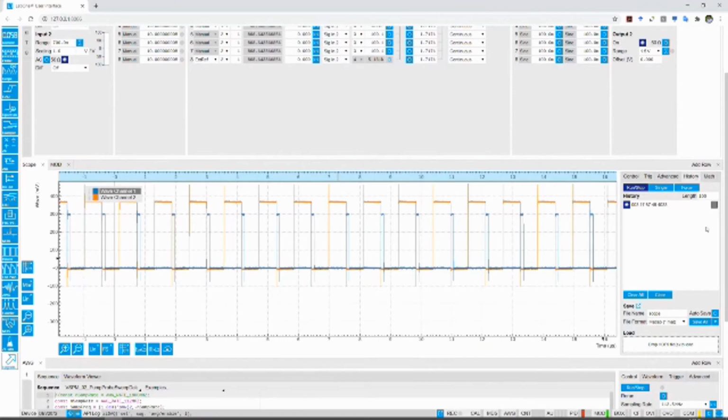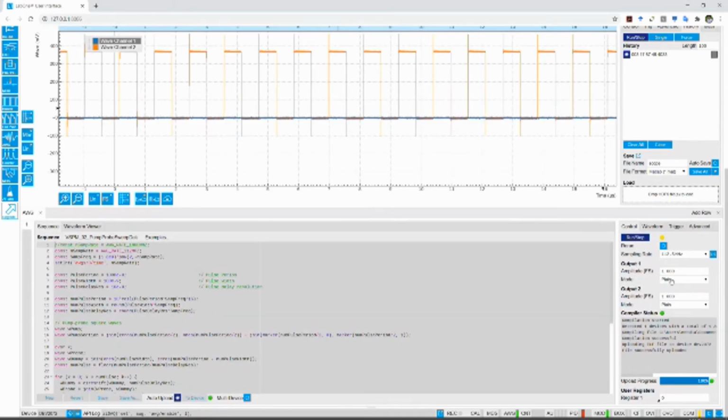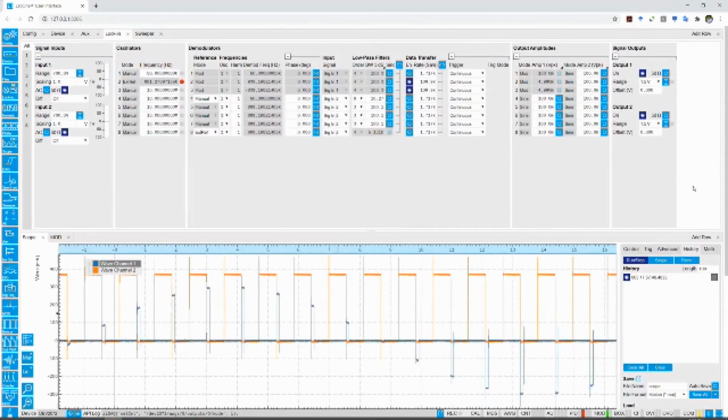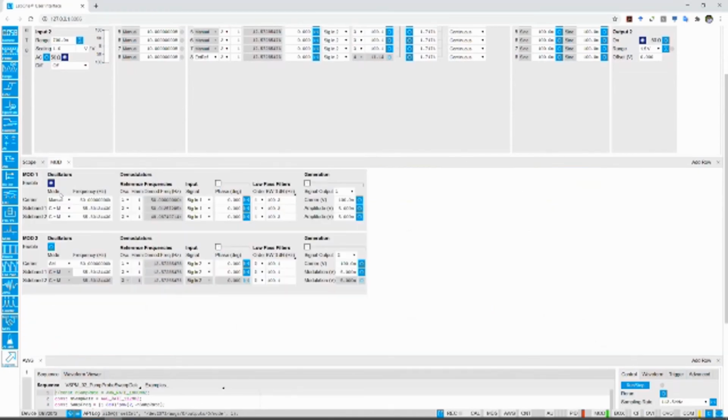pulse. But in addition to that, we also need to have a modulation on our signal. So you can use the modulation option of the lock-in amplifier, and you will see that now the probe pulse has also a modulation in addition to the delay that is swept. Now to do the measurement, we should measure at the repetition rate plus the modulation frequency. And this can be done with our modulation option here that measures at the sidebands, whether it is upper or lower sidebands or both.